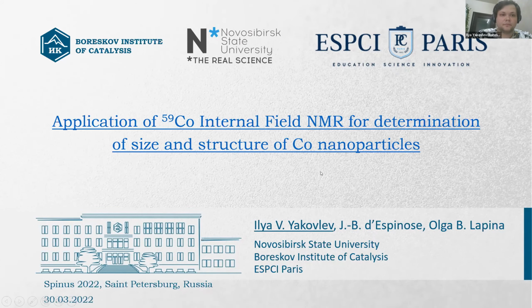The topic of my report today is the application of cobalt-59 internal field NMR for determination of size and structure of cobalt nanoparticles.